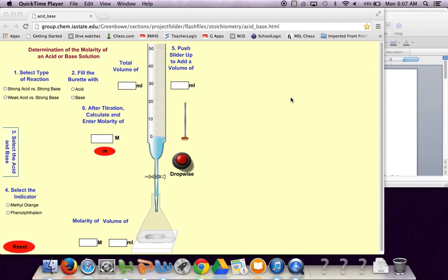Hey everybody, this is Mr. Mott. I'm going to go over how to do the acid base titration that's in your packet.